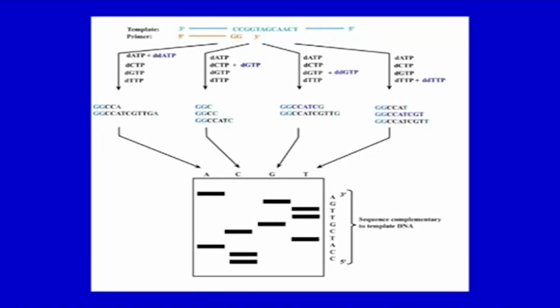One variant of the double stranded approach often employed in automated sequencing is cycle sequencing. This involves a linear amplification of the sequencing reaction using say 25 cycles of denaturation, annealing of a specific primer to one strand only, and extension in the presence of Taq DNA polymerase plus labeled dideoxynucleotides. Alternatively, labeled primers can be used with unlabeled dideoxynucleotides. So, this schematic shows this particular method.